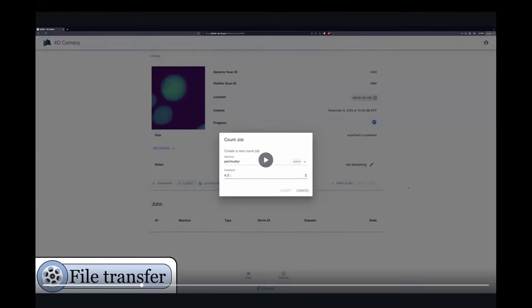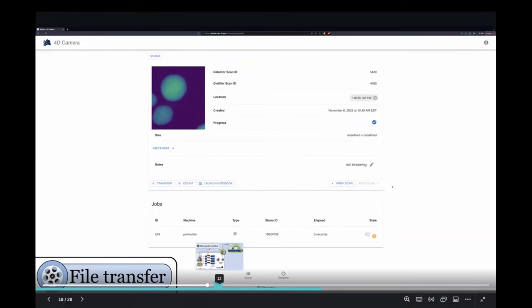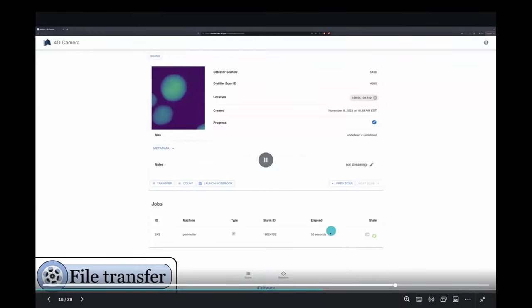And then once they have acquired this scan, they can press this count button. That's going to move their data over and they can change some parameters in here, like the threshold level. They submit that. And this uses the super facility API again to start up a job and you can see that it's been given a Slurm ID and they can kind of track the progress of this as it moves forward. Yeah, so you can see that its state is now active and it's being processed.